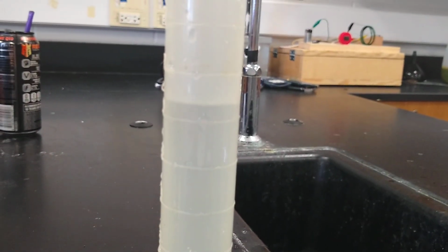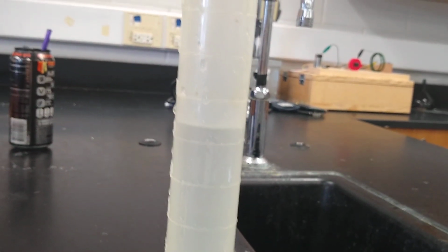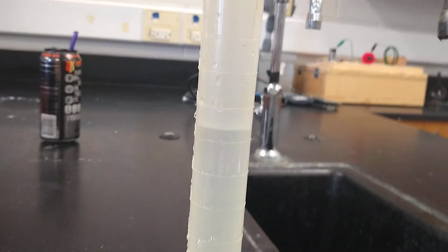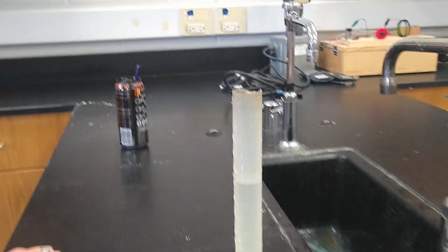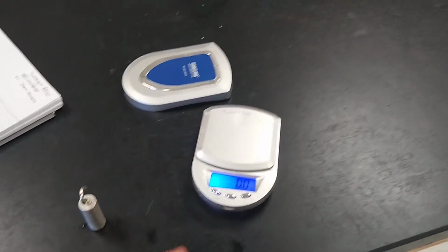And now we're going to read it again. What do you think the new water level is? 73, 74, right between. Okay, so it went from 69.5 to 73.5. So we would subtract those two numbers, and it's 4. It's 4 cubic centimeters. So now we're just going to pour the water out. We know the size of this one, in particular, is about 4 cubic centimeters. So we're going to weigh it. And the mass is exactly 30 grams.